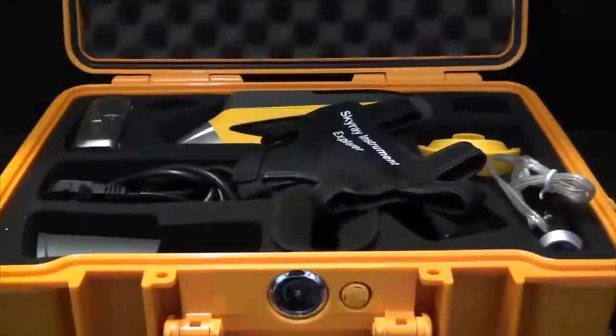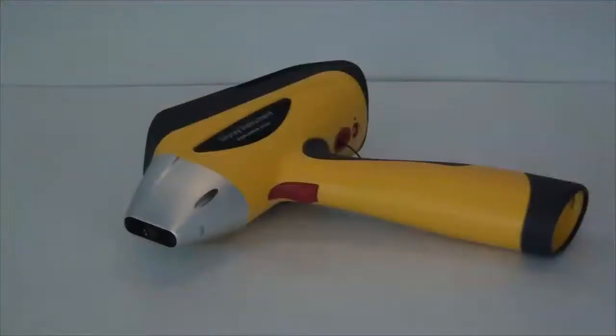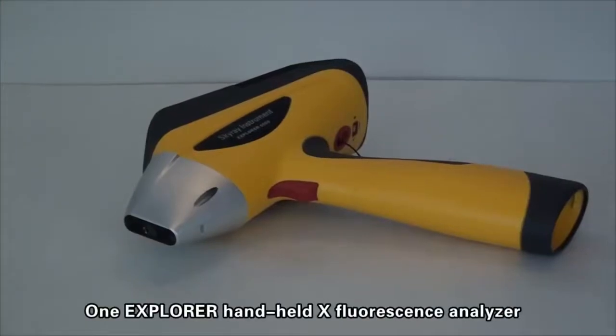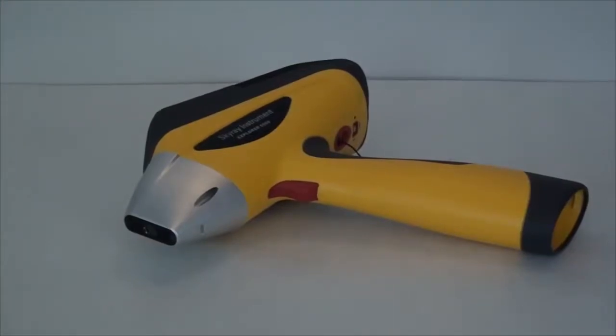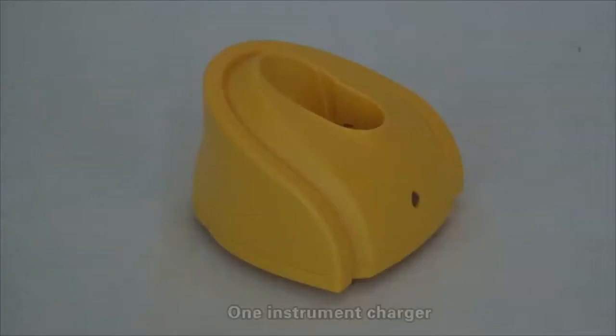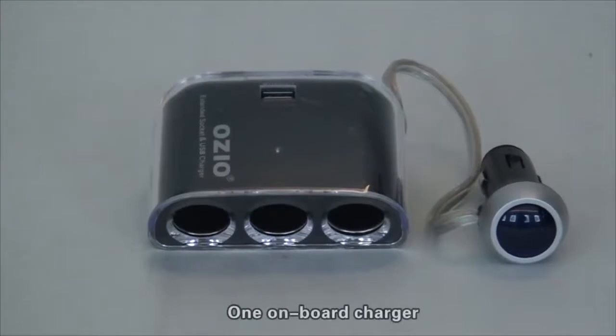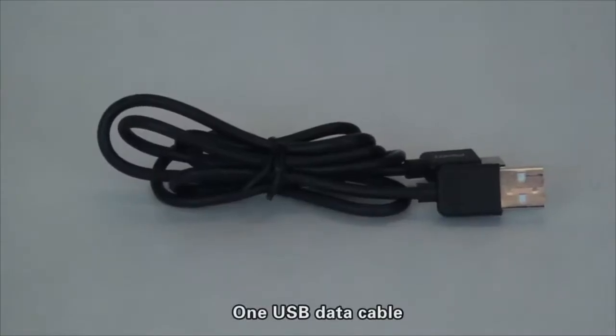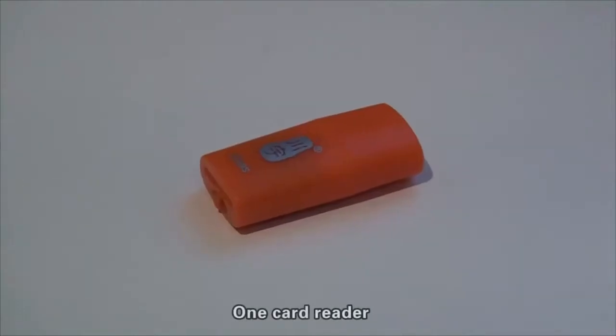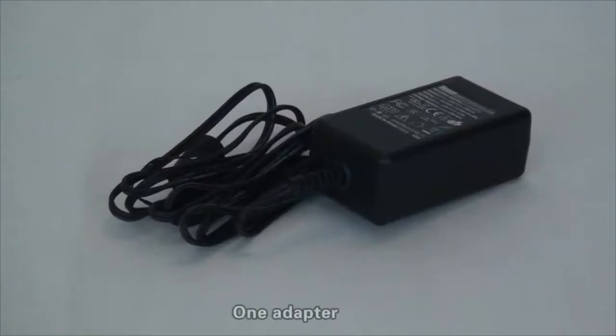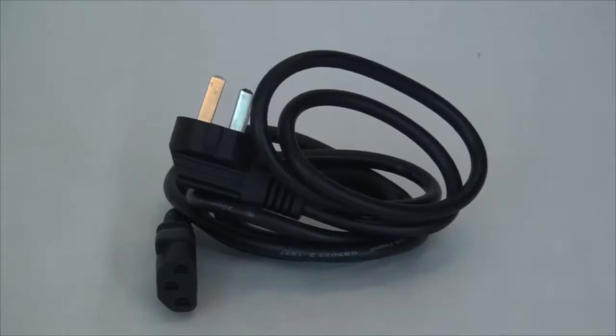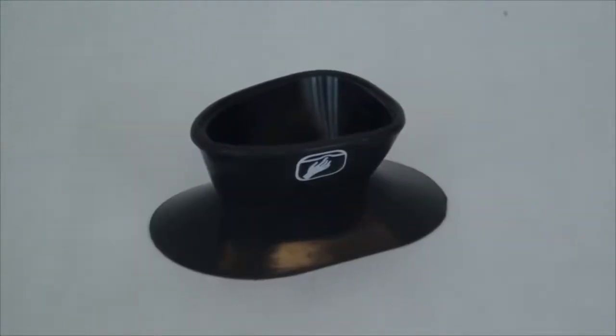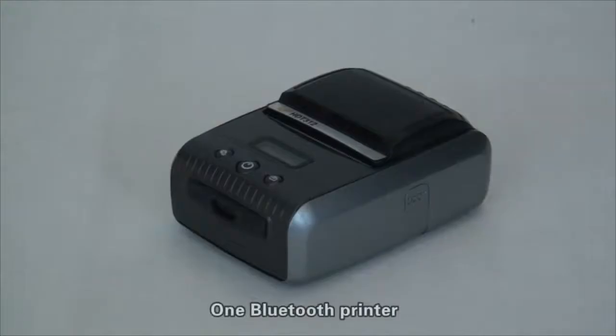Items available in this box include: One Explorer handheld X-fluorescence analyzer, two dedicated batteries for instrument, one instrument charger, one onboard charger, one USB data cable, one card reader, one adapter, one piece of power cord, one dedicated instrument card, one dedicated instrument schedule, and one Bluetooth printer.